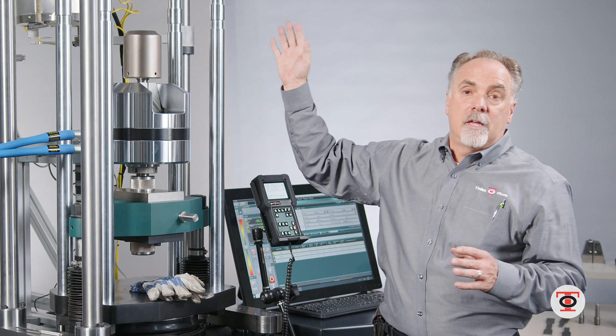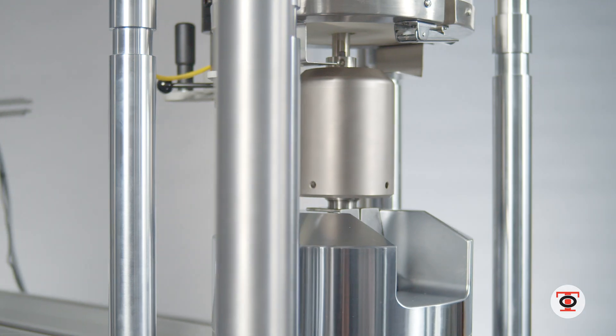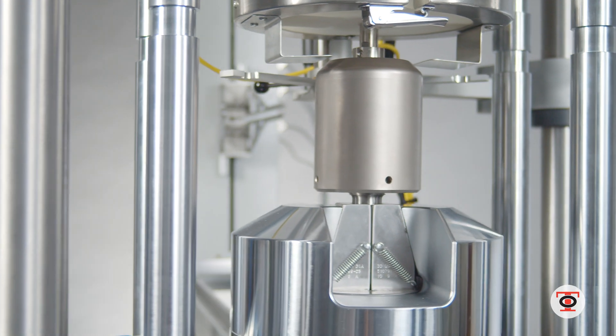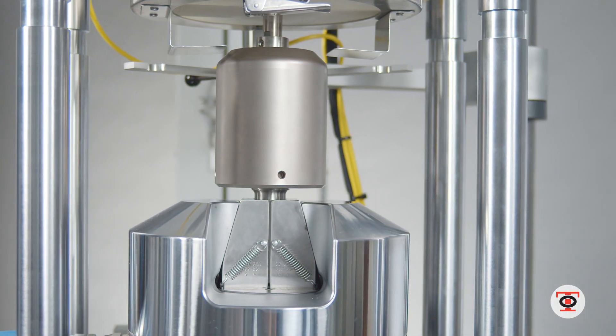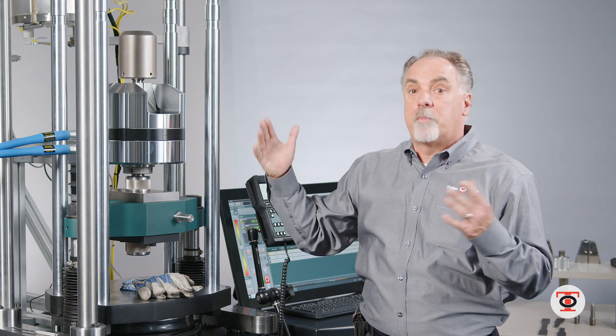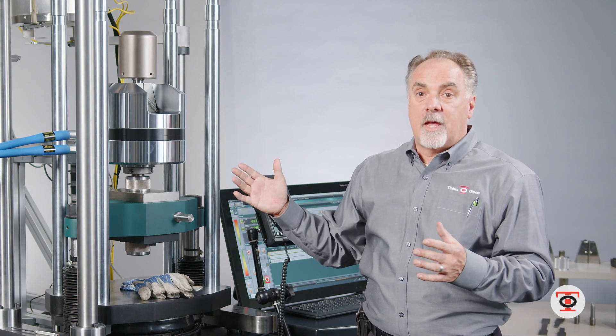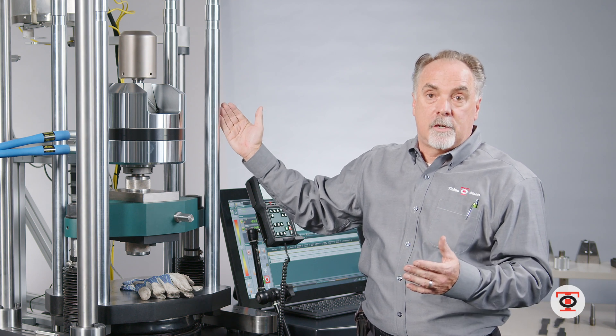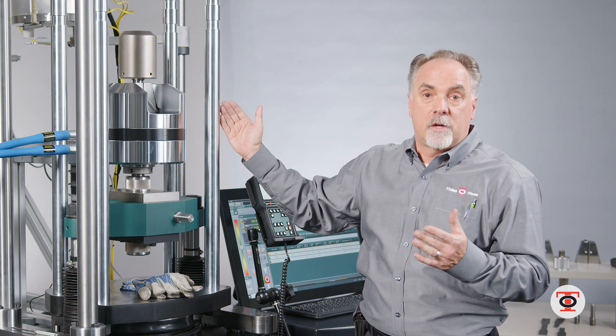This machine is set up for the high temperature furnace tensile test, but you can still use it for compression tests in this zone. It will do your bend, your flex, your peel, and all those different tests — that's what makes it a universal testing machine, which is where the UTM comes into play.